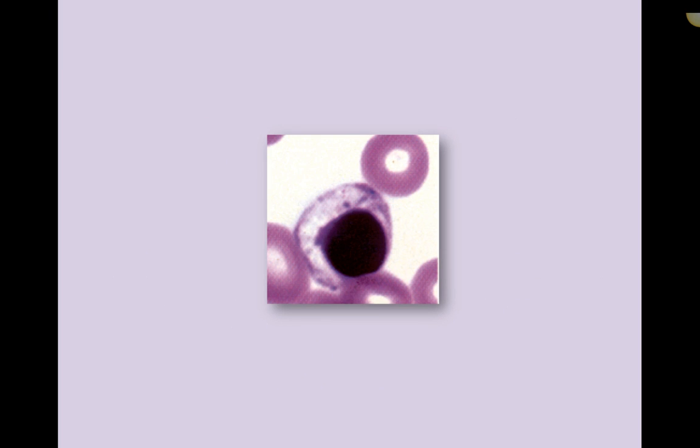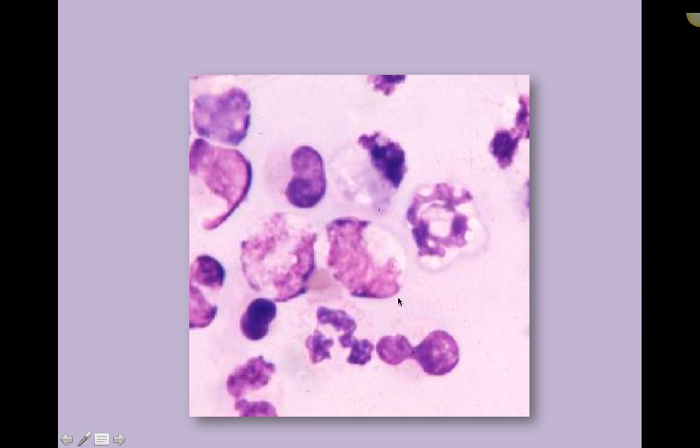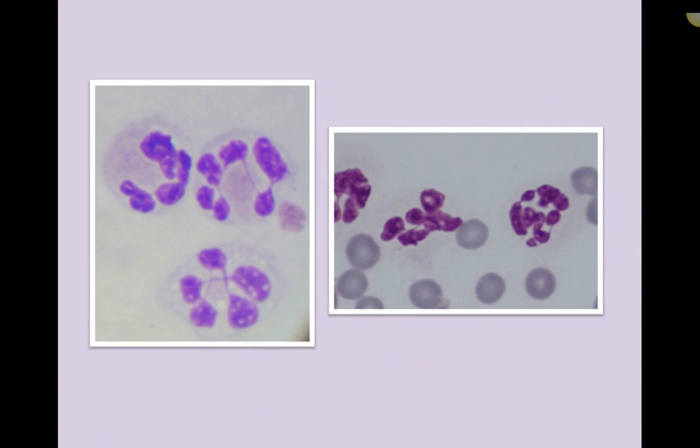This is an example of a neutrophil that has a pycnotic nucleus. These are neutrophils undergoing karyorrhexis. And in this case, this neutrophil here is karyolysis. Okay, and then this is end-stage karyolysis. So this is really a moth-eaten appearance. The nucleus is fading. It's becoming very, very thin, very stretched out. And you can see here even the nucleus is shifting to one side. So that's karyolysis. And karyolysis has so many different stages, it can be really difficult to tell at first. These are just hypersegmented.